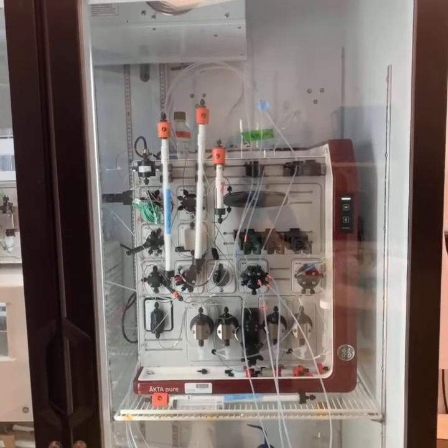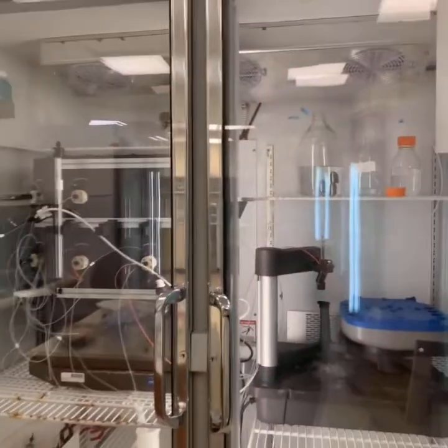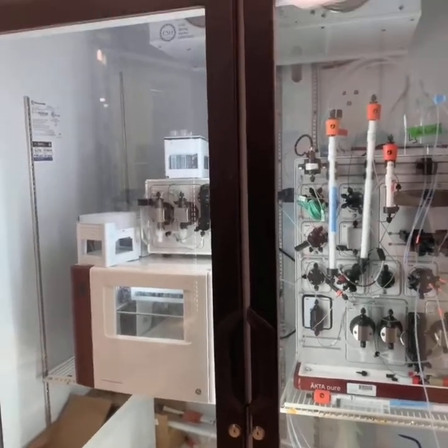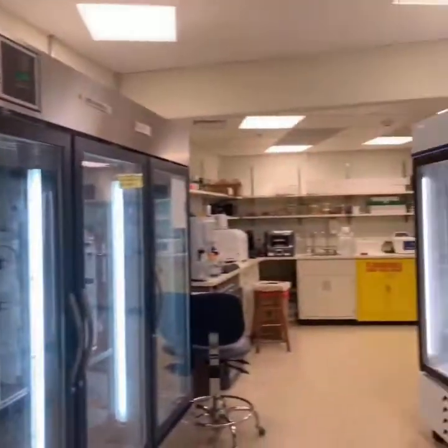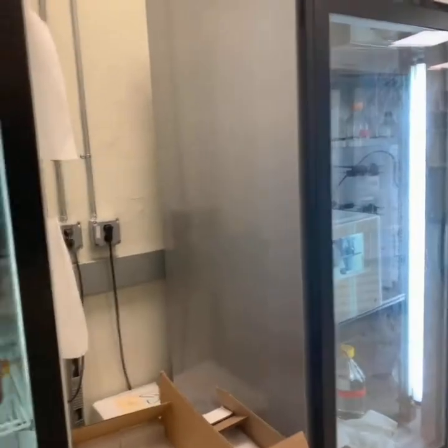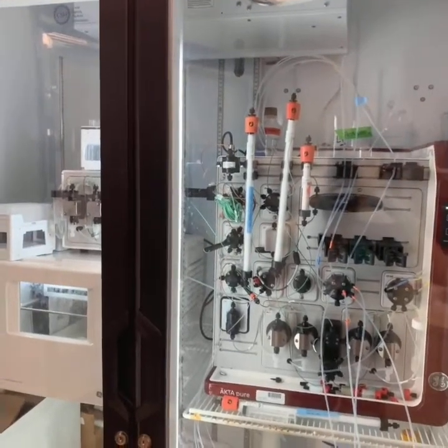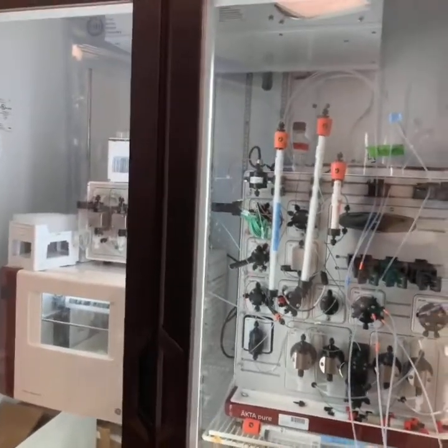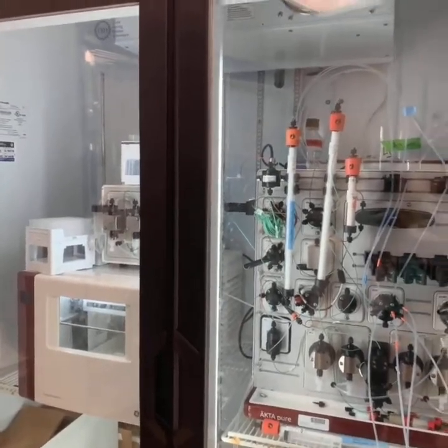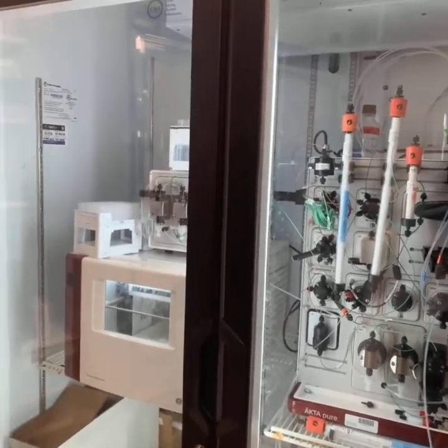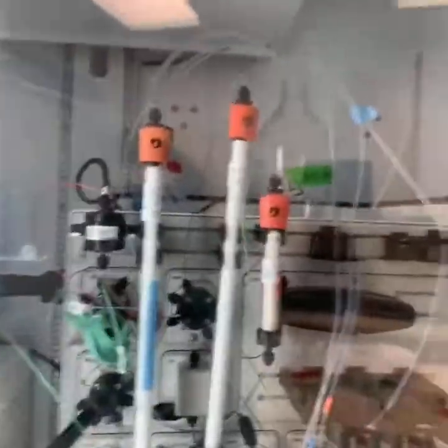So this is an ÄKTA Pure. This is the one that I'm used to using the most. Here's an older ÄKTA. You can see this is the ÄKTA Explorer. I'm really lucky in that I'm in this structural biology lab where we do a ton of protein purification. So we actually have four ÄKTAs, so we have three ÄKTA Pures and one Explorer. And we have these deli fridges so we keep everything cold in here to keep our proteins cold and happy. In undergrad we only had this little benchtop ÄKTA and it didn't have the fridge, so we had a column around the column that actually had a water bath that was keeping it cool.